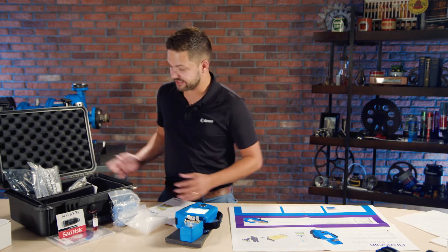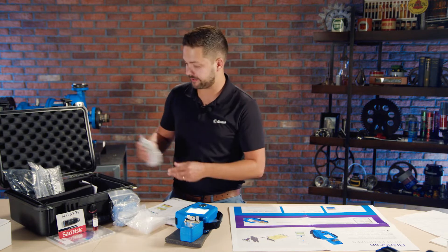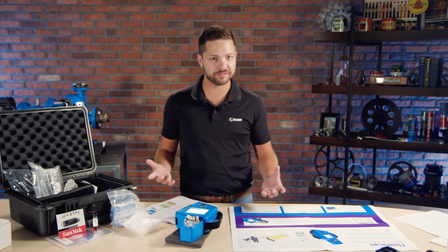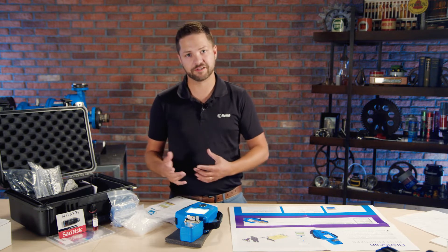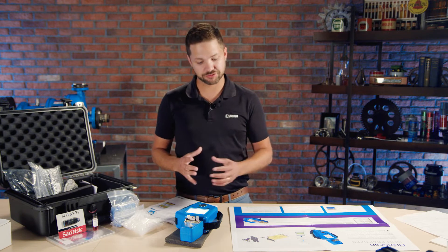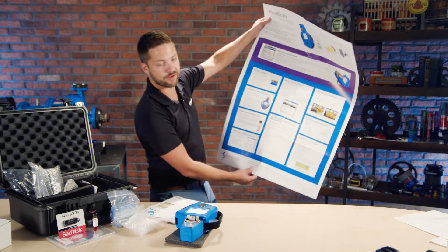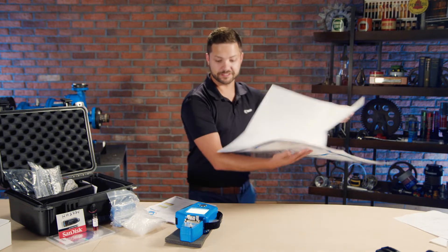Of course it came in a nice case, and there are a few cables to be able to charge it. There's a cable here to connect it to your computer. One thing you don't notice is any solvents or other liquids — it's actually very simple. You don't need a solvent or any sophisticated processes to make sure it works properly. All you need is to wipe it down between each sample and use a couple of drops. Other than that, it's pretty straightforward. You also have this nice poster here, which I've been looking at already to review everything about it — there's a lot of detail, so I'll be putting it on my wall later.